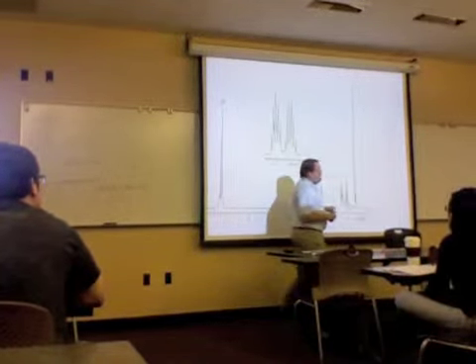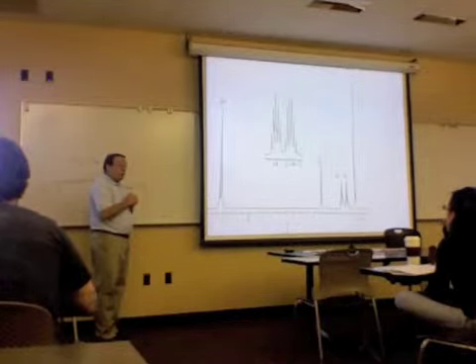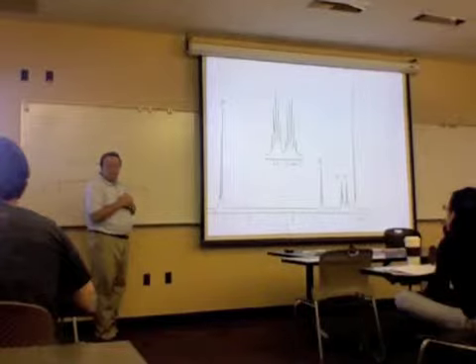The 3 hydrogens is kind of cut off because when I blew it up, but this is a triplet, 1, 2, 3. And if we had really high resolution equipment here, we could actually look at coupling constants. What are coupling constants? The width of the splitting distances. For example, this guy, CH3, is going to be split by this guy, which is the thing at 1.4. So I could actually blow this up and measure the distances, and if they're the same, we've got it. Oh, so the 1.4 peaks would be the same, okay.